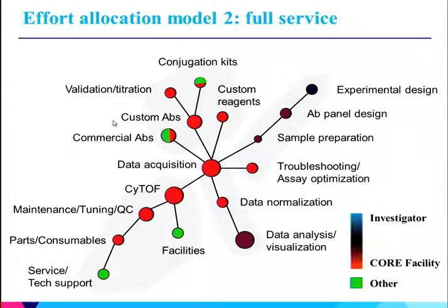And we put a lot of thought into how best to develop that repository. And we used a similar framework to what DVS does in designing their own panels. So we designed a comprehensive, broad phenotyping backbone for both mouse and human that covers all the general cell types most people would be interested in. And then we developed more focused modules to look at, let's say, T-cell subsets or B-cell subsets or myeloid subsets, depending on individual investigators' anticipated needs.